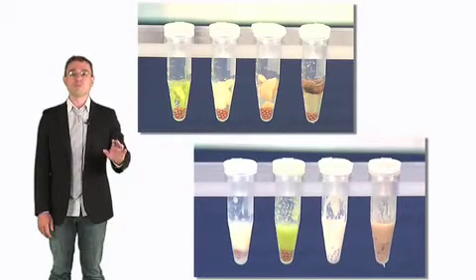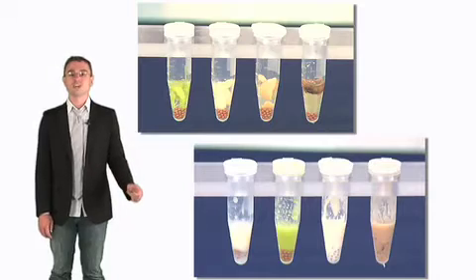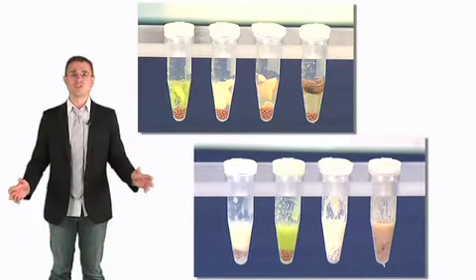The Bullet Blender is a very flexible, dependable tool capable of homogenizing, vortexing or lysing your samples, and it's so easy to use.